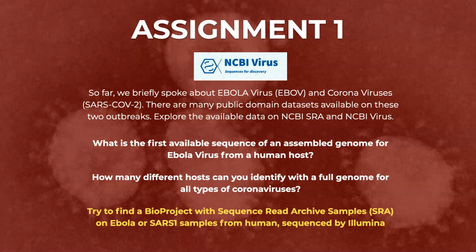And finally, the real assignment is to try to find a BioProject. Okay, so this is a little bit more than just looking on NCBI Virus, which is kind of easy to use. But now let's talk about BioProject with Sequence Read Archive samples, right? So they will be FASTQ files, but they will be compressed in SRA files, on Ebola or SARS-1 samples from a human host sequenced by Illumina.